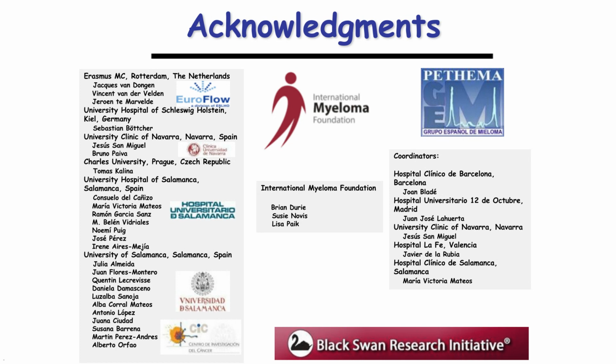Perfect, thank you. Our next question is, do you use CD38 in your panels for DARA patients? No, we are not currently using it. We have evaluated that specific marker locally, and there are also a few papers and results produced by other researchers within the scientific community. In our hands, and in some of the other results that have been shown, that marker is not that easy to get completely bright and good staining.